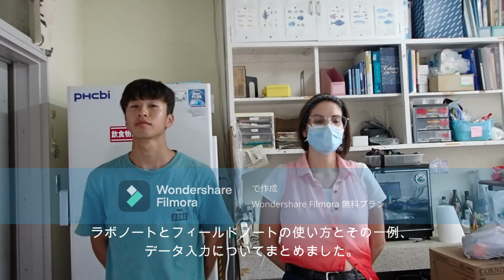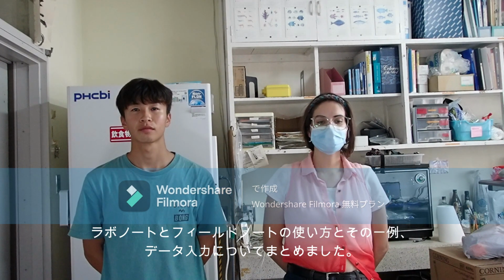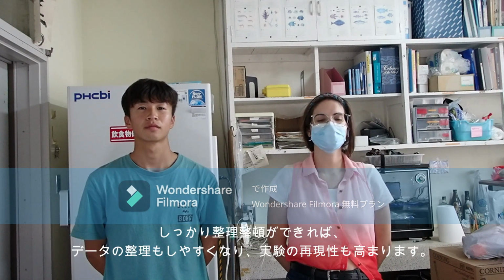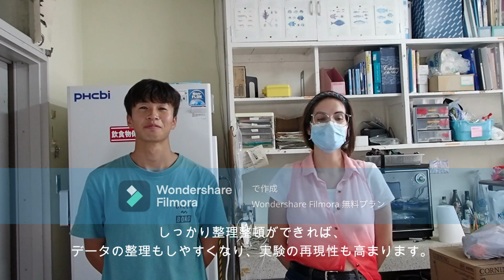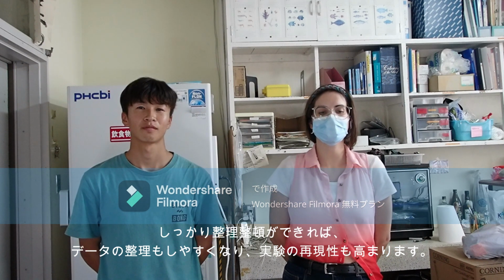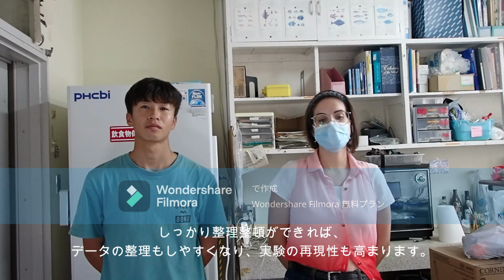So this was a summary of lab and field notebook use, best practices, and data entry. Basically, the concept is the more organized we are, the easier it will be to organize also our data, and the more replicable our experiments will be.